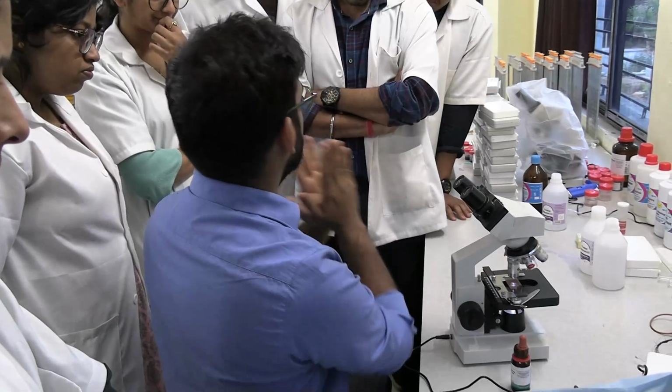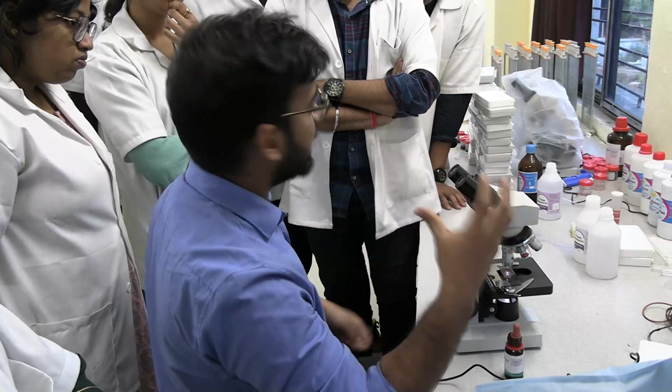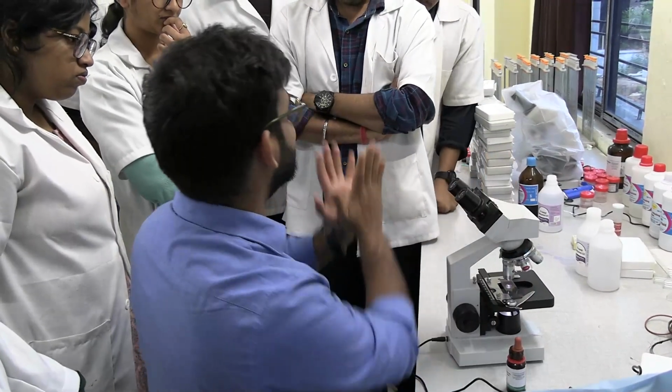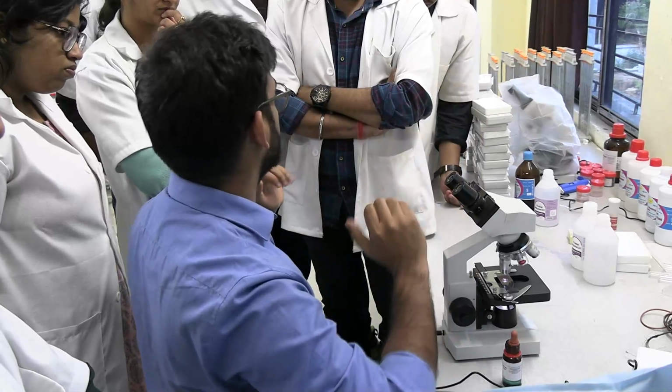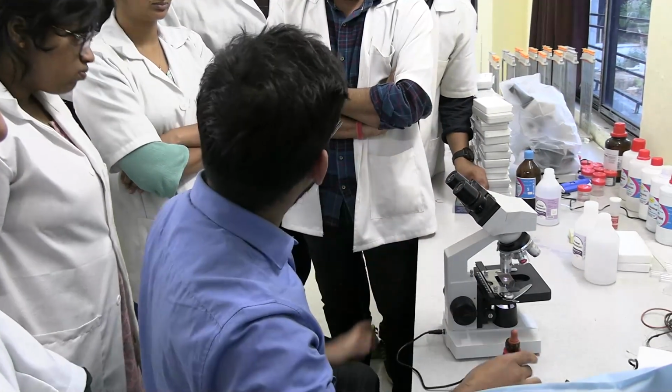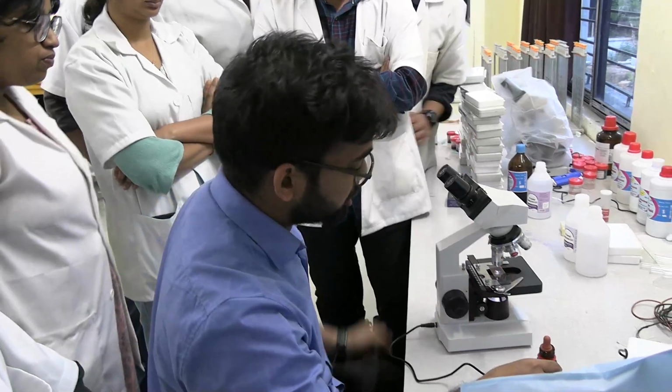Otherwise, what will happen? Air is a lighter medium, so the light will be dispersed. The oil converges the light and helps focus it. That's why you use cedarwood oil or immersion oil.